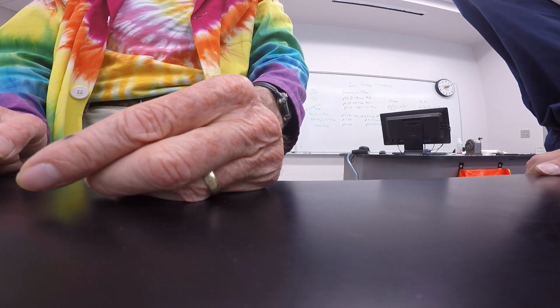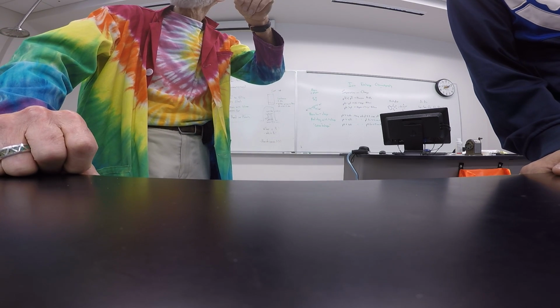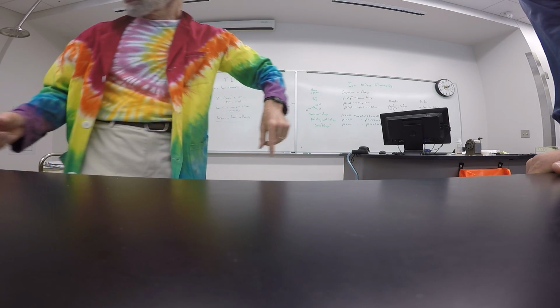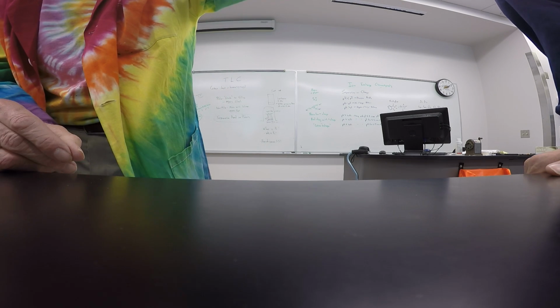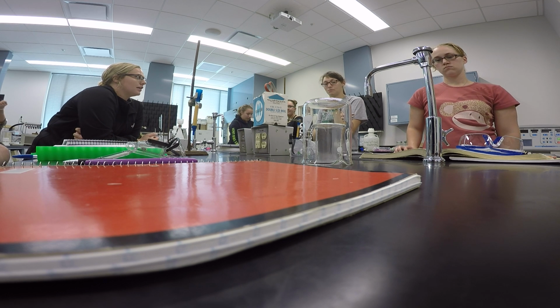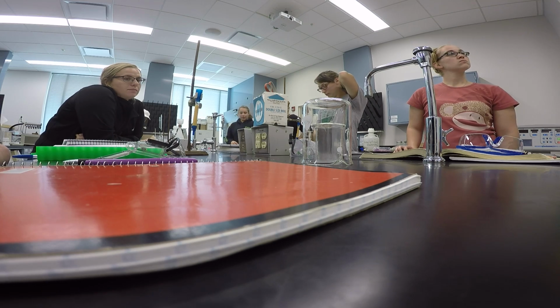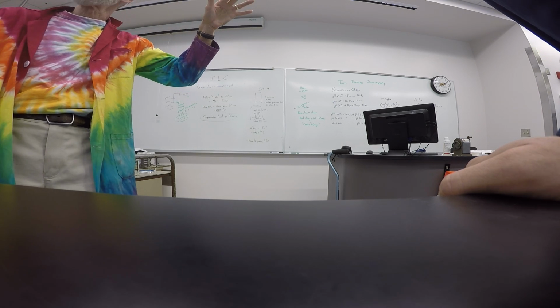Now that's not a terribly great seal. So the second thing I want you to do is put a 1,000 ml beaker over the top. You should have a 1,000 ml beaker in your biochem drawer. So just grab one out, give me a quick demo. 600 may work. Yeah, 600 works. Put that over the top to give a little additional seal so we don't have to be sniffing that PAW solvent all day long. So that's the setup you have. And as the book says, once you get this set up and going, this will take half an hour to an hour to develop. So you just ignore it and you go on to part 2.